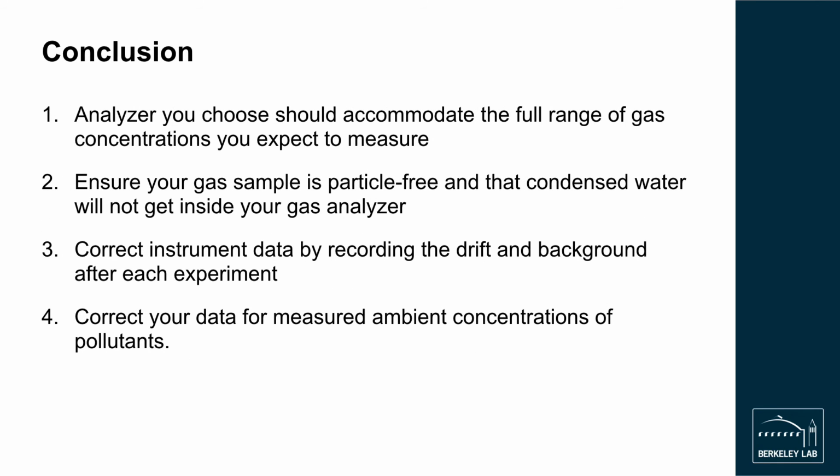To review, the gas analyzer you choose should comfortably accommodate the full range of gas concentrations you expect to measure. Ensure your gas sample is particle-free and that the condensed water will not get inside your gas analyzer. As good practice, you may also want to check the accuracy of your instrument and the data by recording the drift after each experiment. Lastly, correct your data for measured ambient concentrations of pollutants.